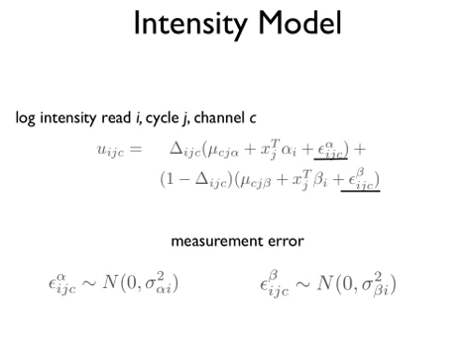So the model that we've been using, we actually have tried to improve the base calling method that exists, is to assume that the observed signal is a mixture of two things. That's a mixture model in statistics, so the delta tells you it's either 0 or 1. If it's 1, it means you are looking at the correct base. If it's 0, then you're going to look at the other side. So this will be the signal part, and this will be the background part. And the rest of what you see there is the formula for a line.